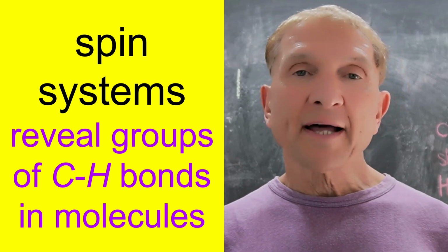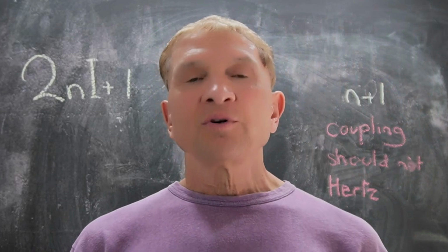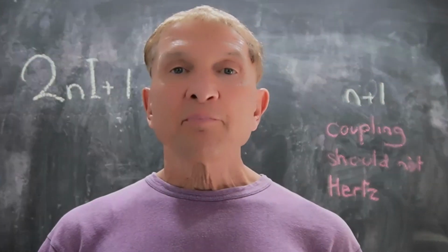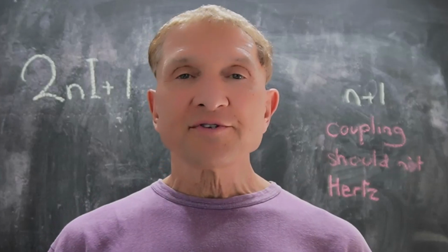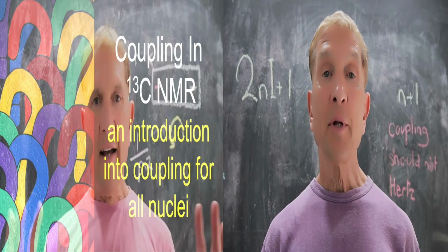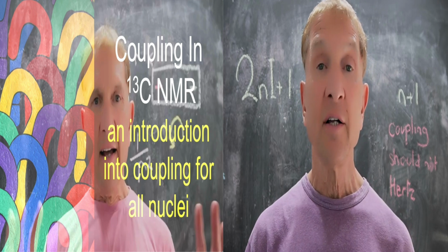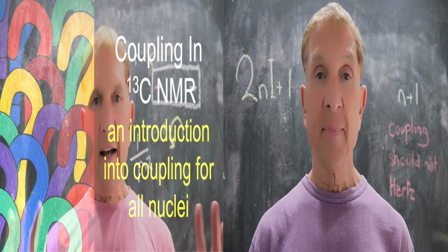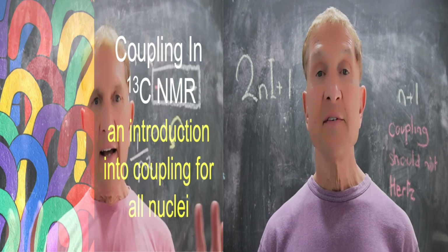an unknown compound. I'm going to have a go at explaining the origins of proton-proton coupling before telling you what's really important to know. Watching my previous video on coupling in 13C NMR will help you a lot because that's easier to understand. The link for that is down under.